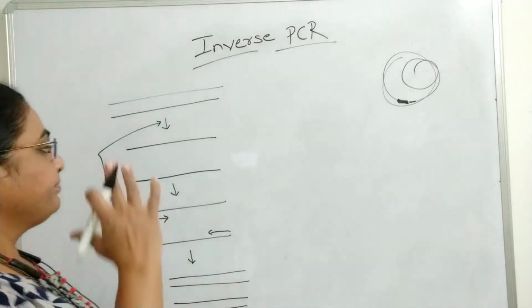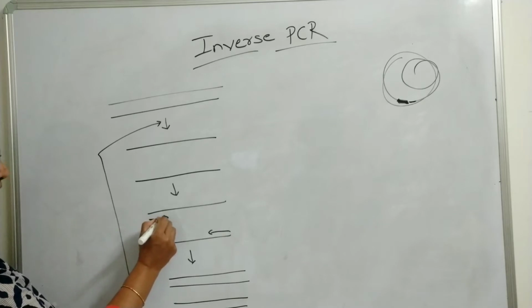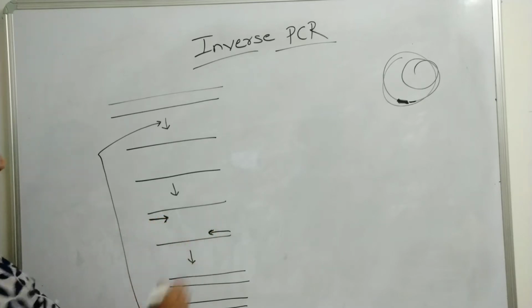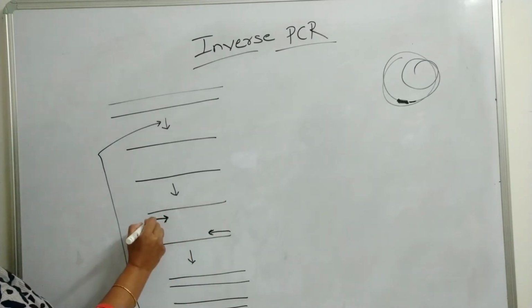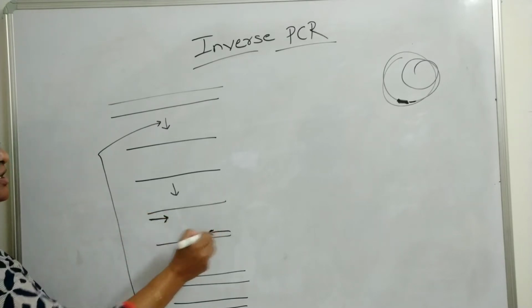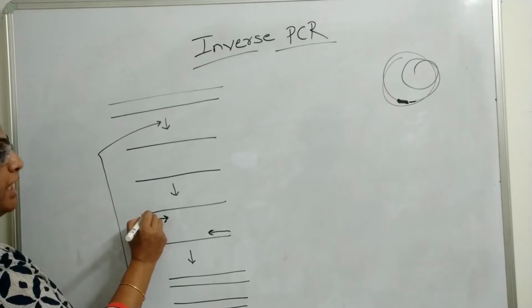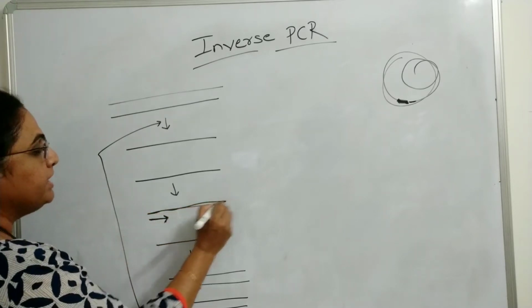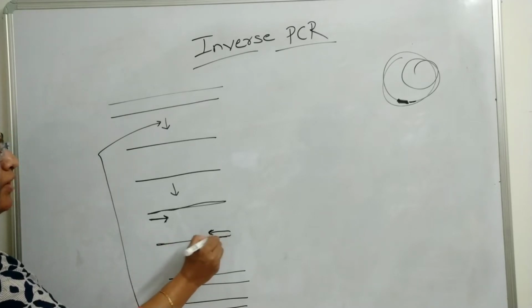and then you get the amplified DNA product. Now here when you are saying that you are adding a primer, the reaction is in vitro. So this primer you have to design and synthesize, and for the synthesis of this primer there is a need to have information about this template DNA. For the designing of the primer, what is required?